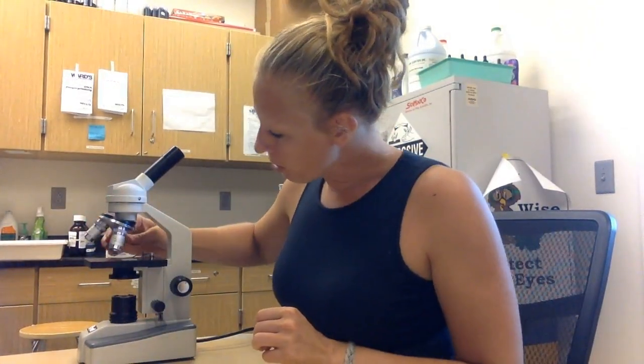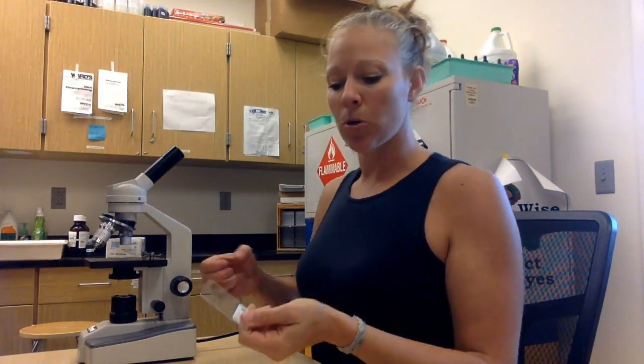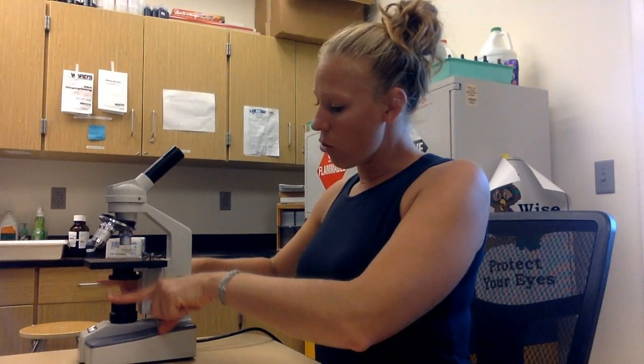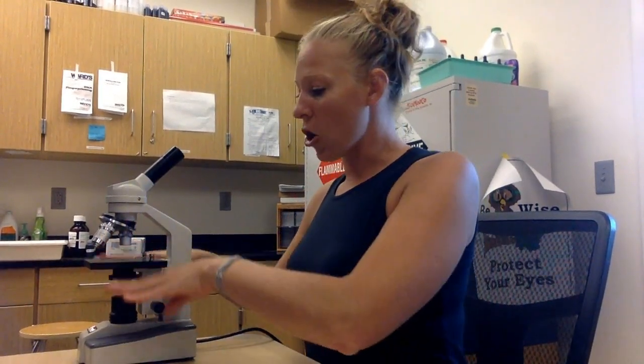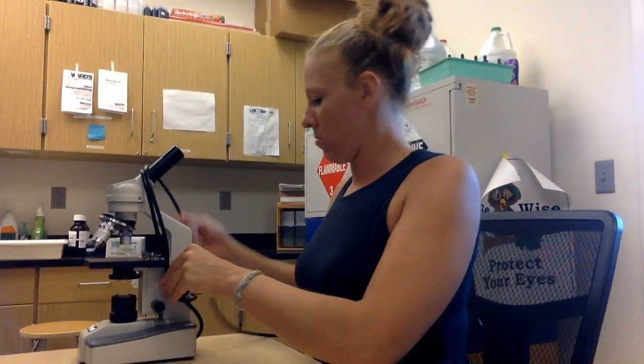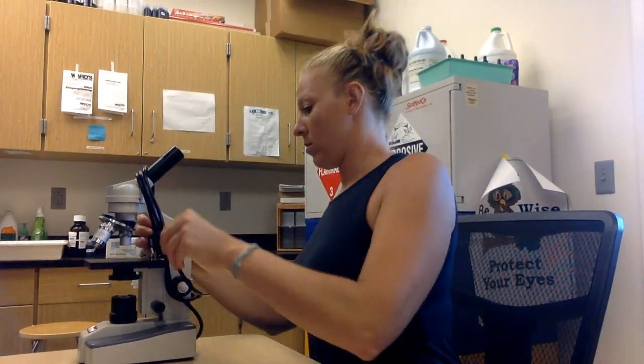Finally, I want you to practice microscope etiquette. The next person using this microscope needs to start with the stage all the way down on the smallest objective lens. So always remove your slide — don't leave it on, because it will slide off and break. Please don't put cover slips or slides in the sink either. Drop the stage all the way down, then switch the objective lens to the 4x — the smallest — so it's ready for the next person.